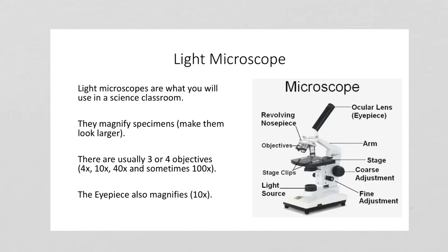We'll start with the bit that you actually look down, which is the ocular lens, often referred to as the eyepiece. This has some built-in magnification, often 10x magnification, and that's the bit you look down to see the specimen.